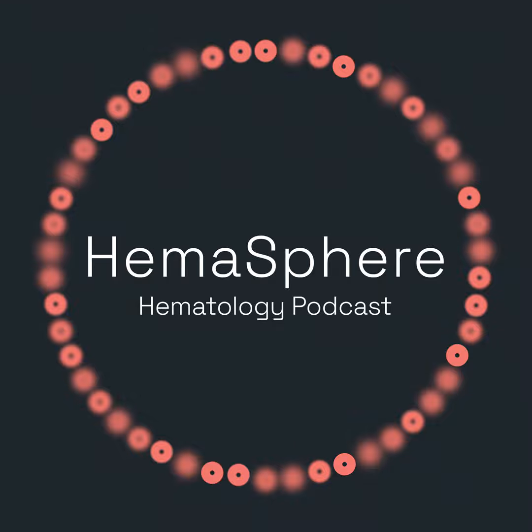Yeah, because just to go over those points, the variability not only within the institute, but across institutes. I'm assuming as well, the type of flow cytometer machine that you've got is going to increase variability, whether you've had it maintained regularly. I'm guessing there will be like NATA accreditation that you have to have in clinical labs, but still, as you say, the subjectivity between operators, between institutes will be great.